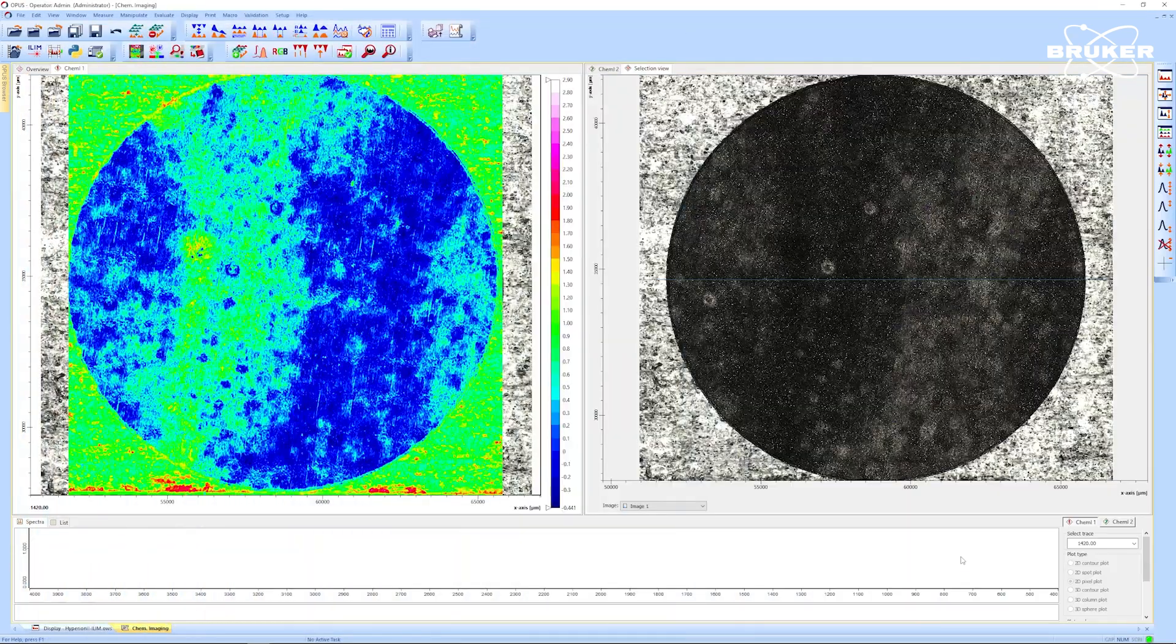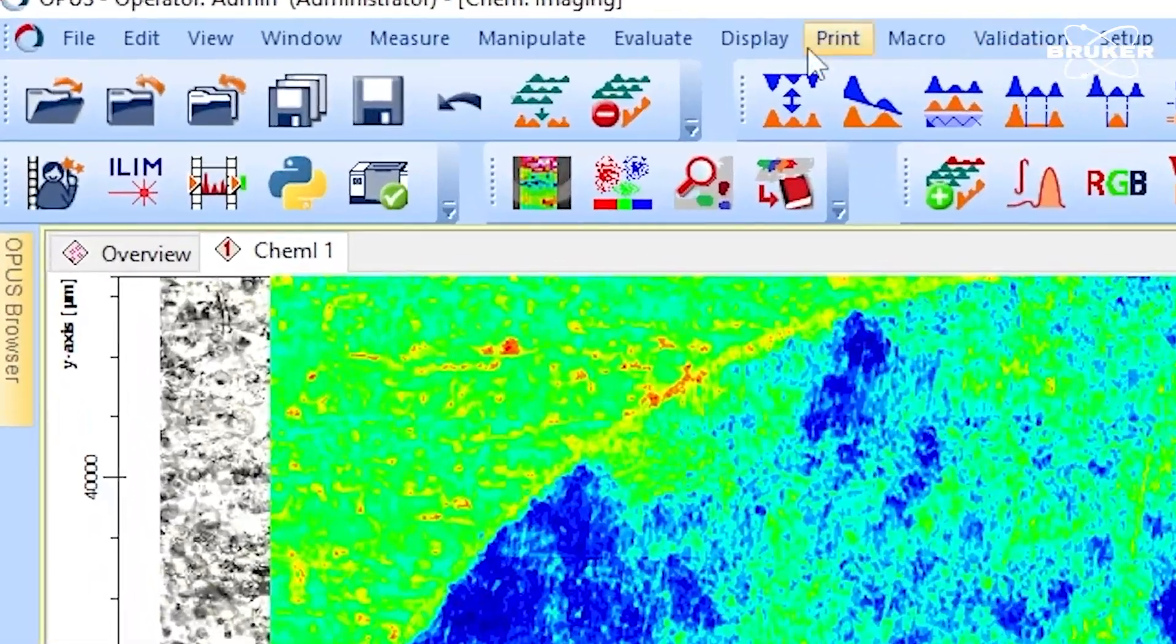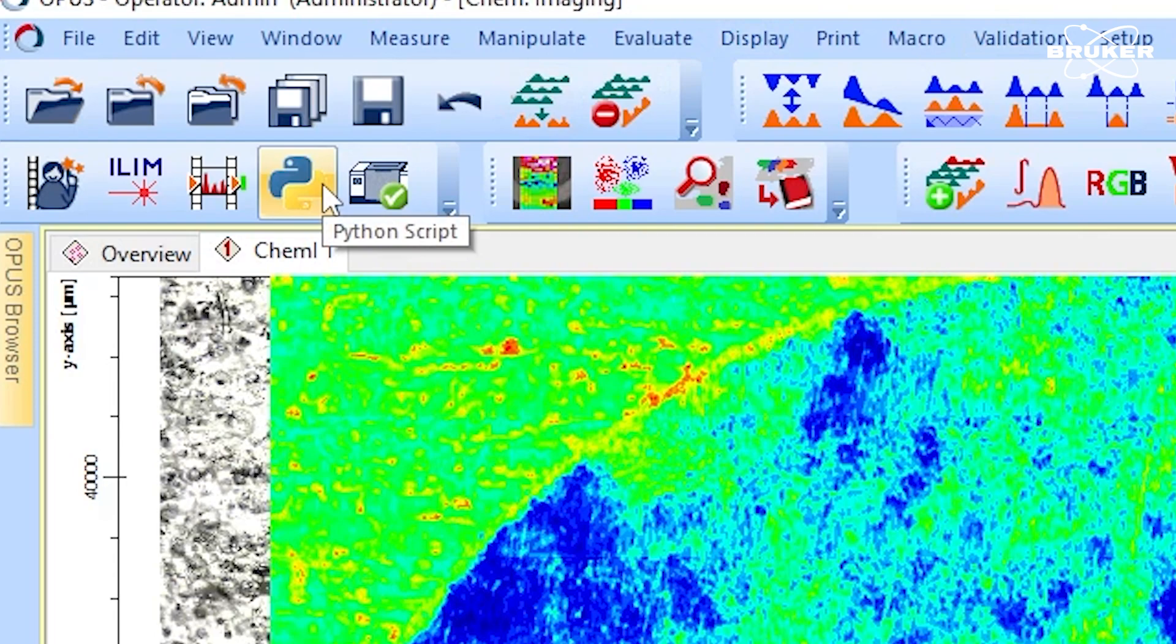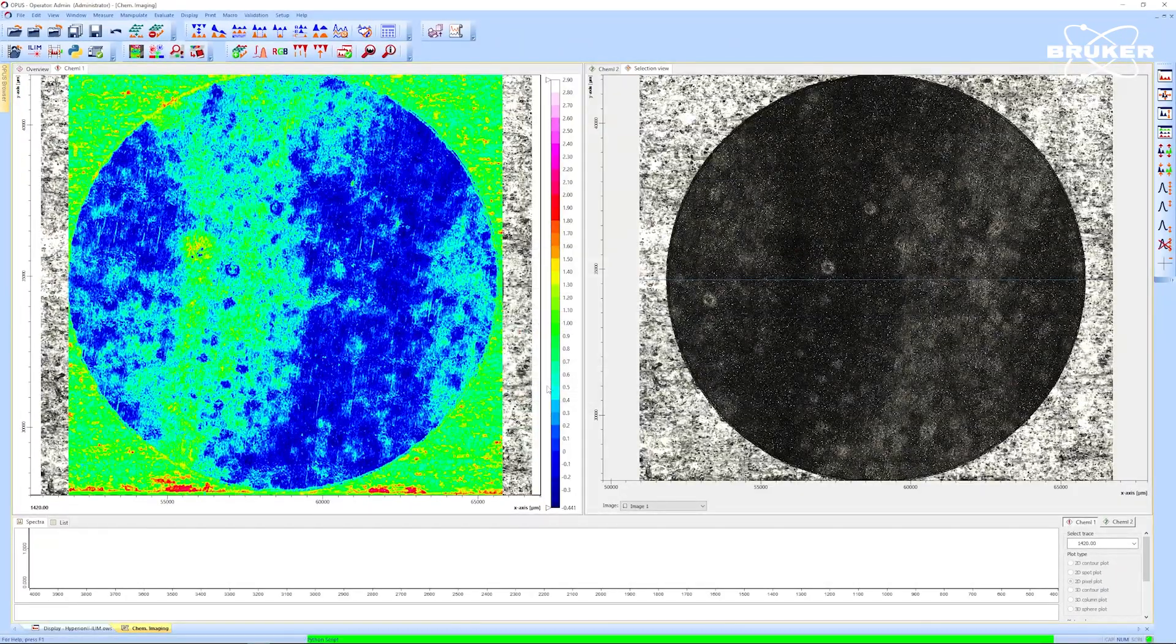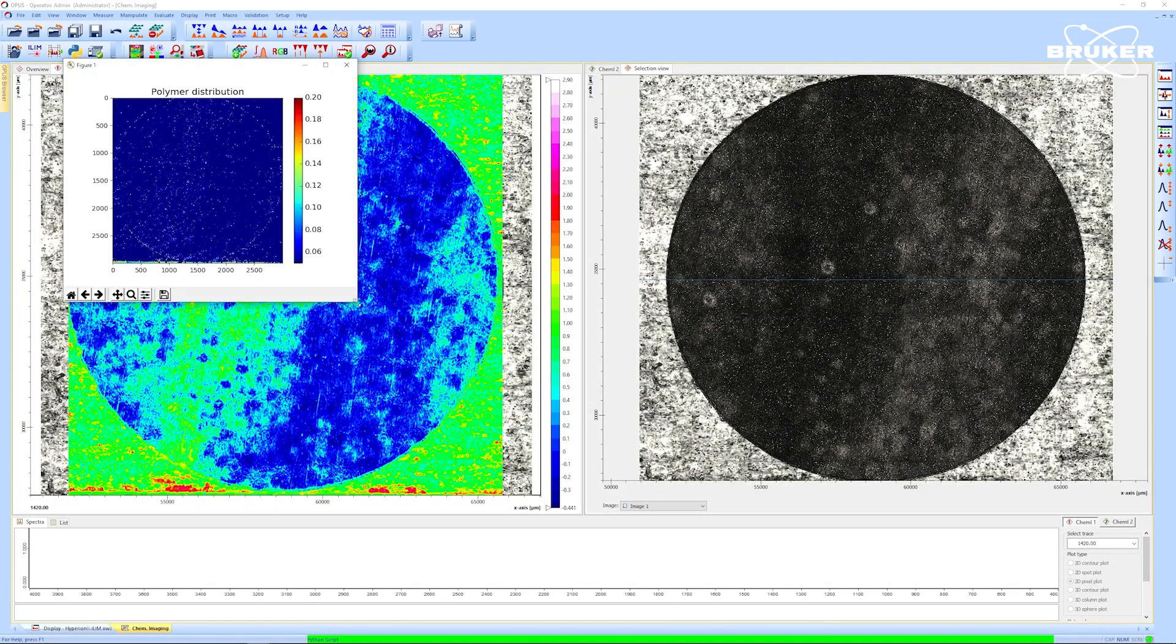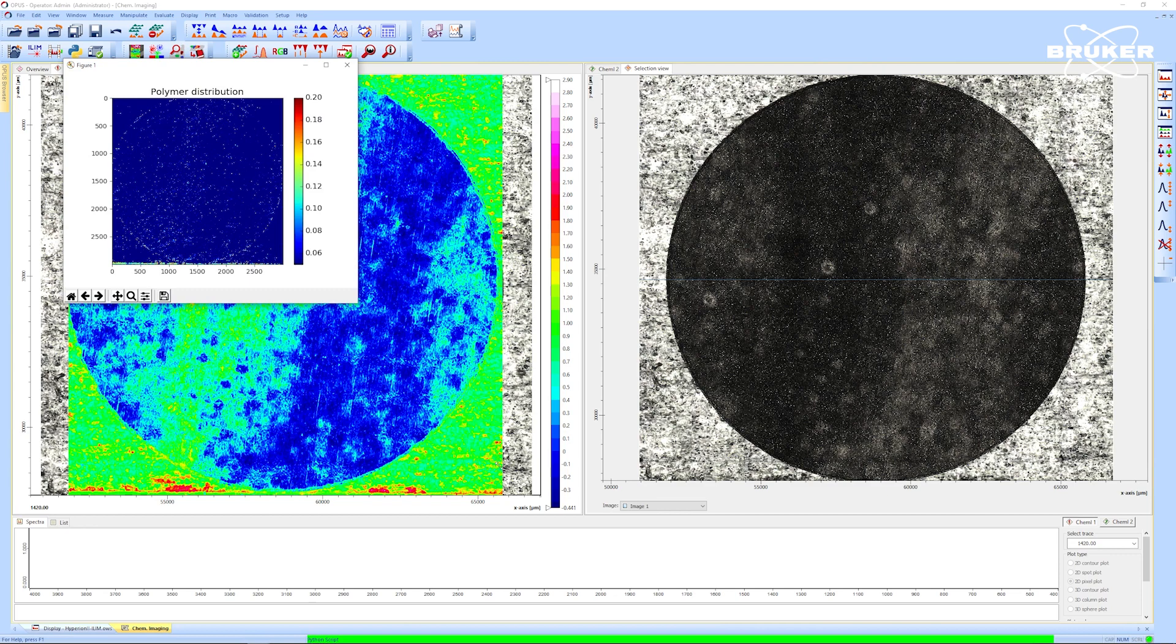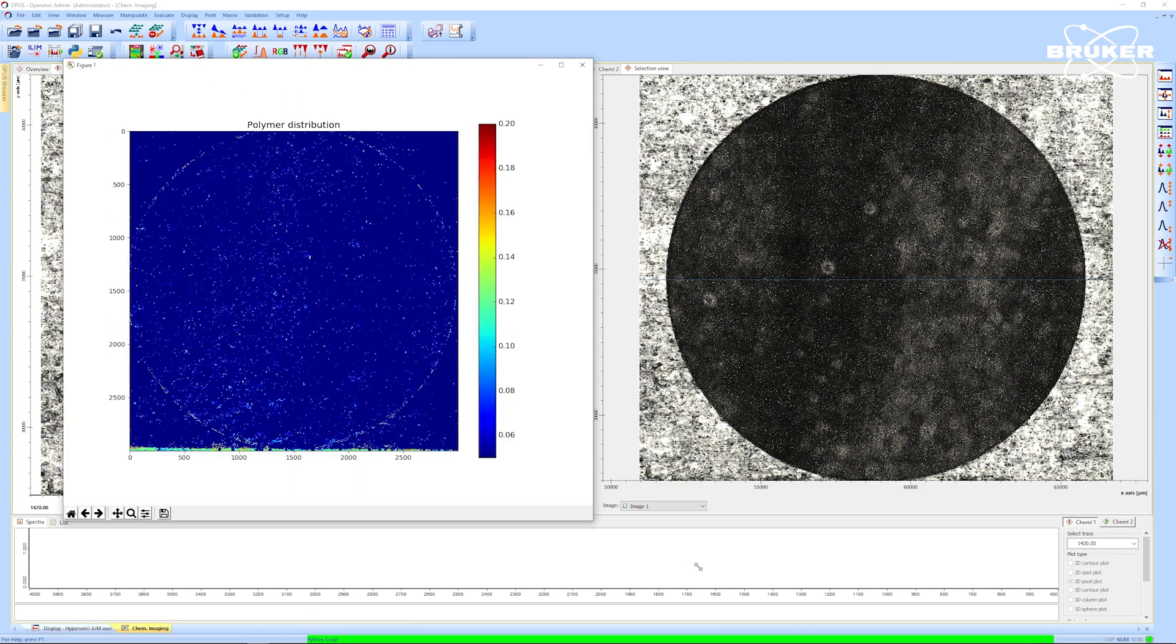Evaluation is done by starting a custom Python script, providing us with a comprehensive visualization of the PVDF distribution in a new window almost instantly.